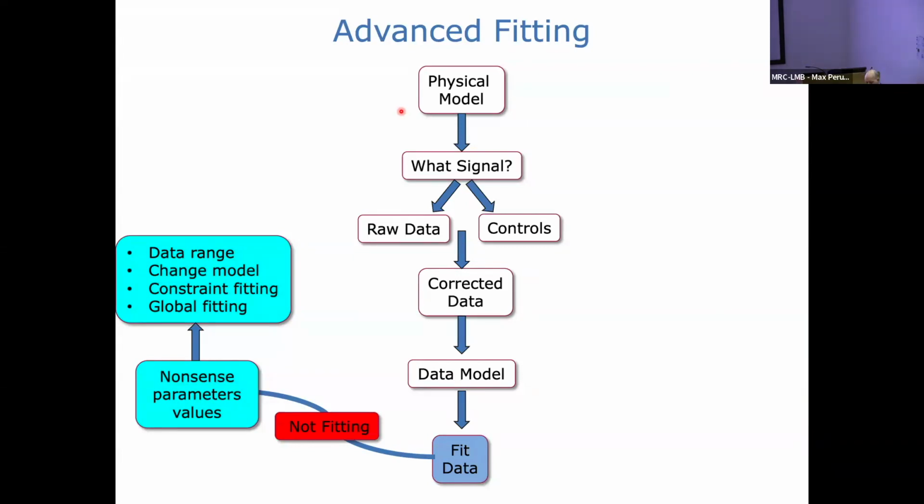Yeah, so in the past I was working with a protein which had a two-step binding process, but we could not go high enough with protein concentration to get the second KD because this was in the millimolar range. So in this case, is it okay if I just remove these data points and try to fit the first KD? So what are your thoughts on that?